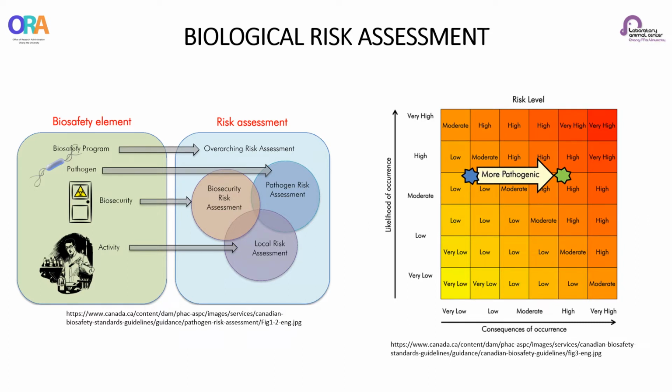It identifies the activities that can result in a person's exposure to the agent, the likelihood that such exposure will cause an LAI, and the probable consequence of such an infection. The information identified by risk assessment will provide a guide for selecting appropriate mitigation, including the application of biosafety level and good microbiological practices, safety equipment and facility levels, and safeguards that can help prevent your risk of LAIs.